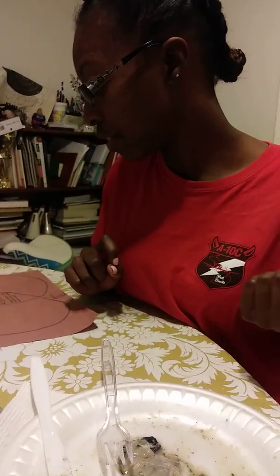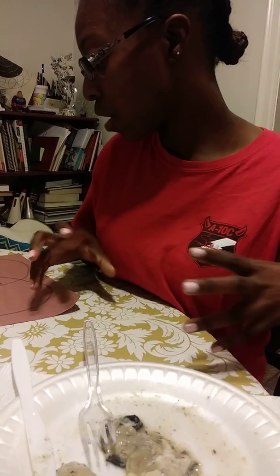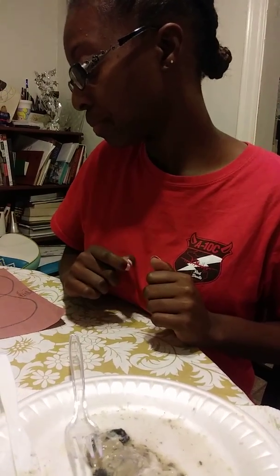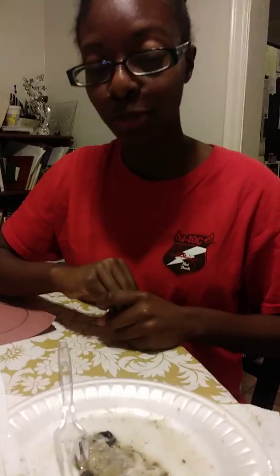It has gills like a fish. They eat algae, and the minerals that are formed from eating the algae is called nacre, which is how the pearls are produced. And they have colorless blood. That concludes the marine biology research of clams. Not clams, oysters. Sorry.